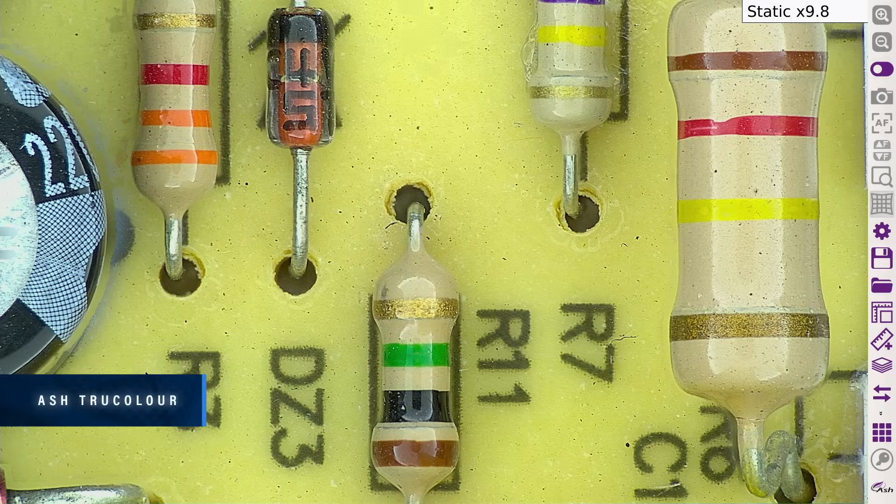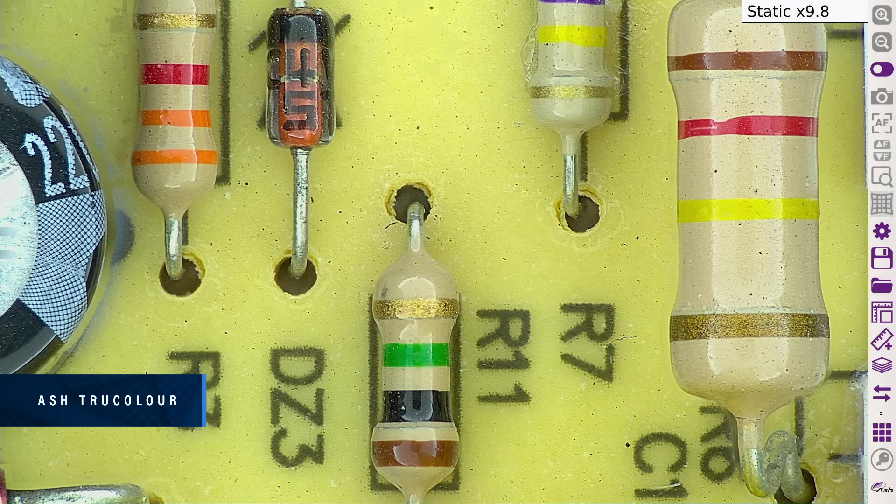View true color reproduction of your sample with the Omni 3. Replicate real colors as seen with the naked eye.